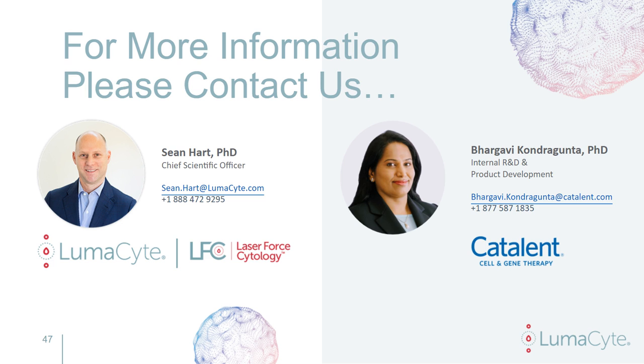LumaCyte is currently working to overcome the current limitations of the AAV infectivity measurements by using their nuclei analysis as opposed to the whole cell analysis method, and this could increase the sensitivity besides the current method of co-infecting with adenovirus. So yes, whenever this becomes available, I think this would greatly enhance process development, helping us select for the process where we also measure the AAV infectivity in addition to the typical measurements we do, such as ddPCR titer.